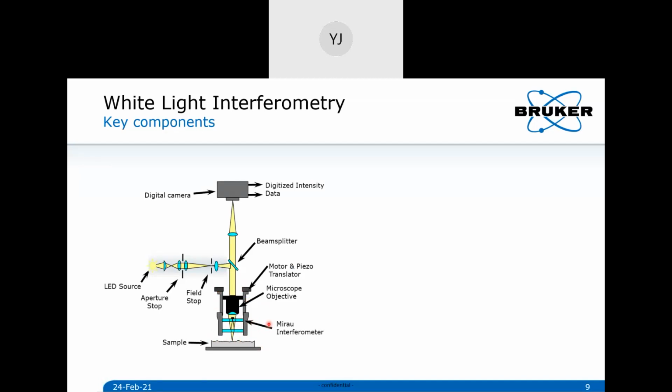These are calibrated at site. At the installation, you will have calibration samples which are certified. Then you can use the certification to calibrate and periodically check. From my experience, there is not going to be a lot of drift. It's not going to change.